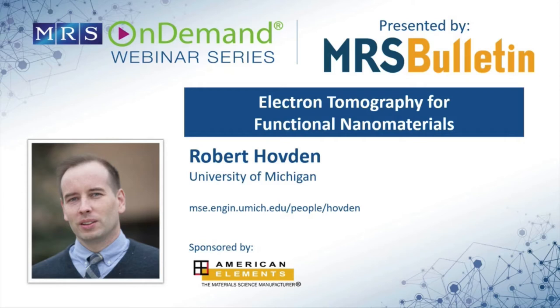One way researchers are innovating to reduce the size of the missing wedge artifacts is looking to new reconstruction algorithms. One that has shown a lot of promise in the last couple of years is compressed sensing, first introduced in the mathematics community by Candace and Tao in 2004. Paul Midgley's lab demonstrated applications in electron tomography in 2011. It seems to do a remarkable job at reducing the effects of the missing wedge. There are also iterative reconstruction methods that jump between real space and reciprocal space. Even without a missing wedge, you don't have perfect reconstructions, so you have to have a careful eye.